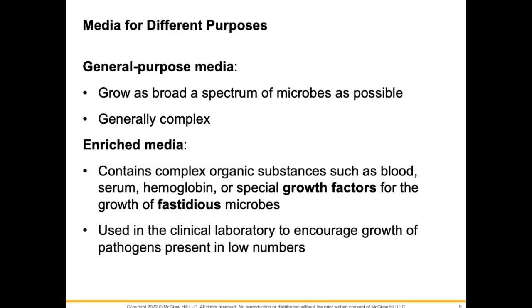We also have enriched media, and that contains certain things. They put additives in that, like blood or serum, hemoglobin. Sometimes they put growth factors, depending on the type of media. And we use enriched media specifically for fastidious microbes. And fastidious microbes basically implies that they're picky.